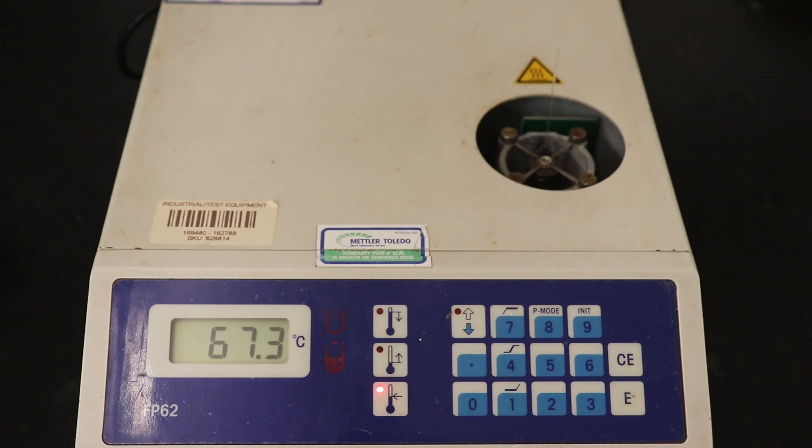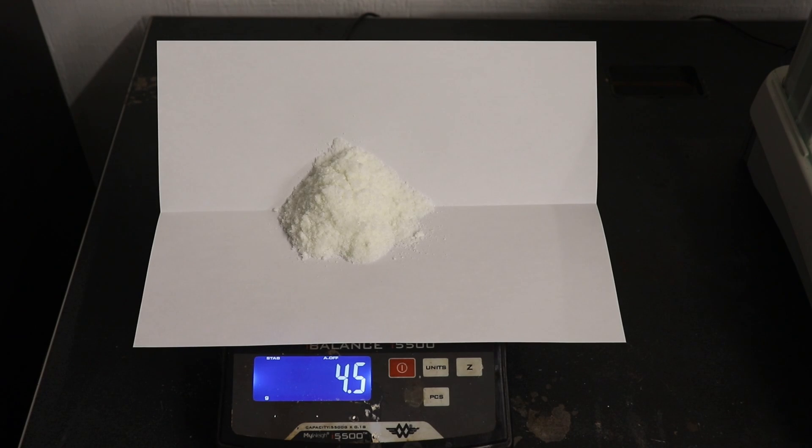The melting point of the biphenyl was found to be 67.3 degrees Celsius at a heating rate of one degree Celsius per minute, compared to the theoretical melting point of 69.2 degrees Celsius. This is an acceptable melting point and demonstrates that biphenyl has been successfully synthesized.